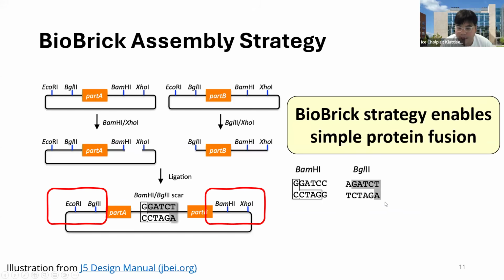So, this assembly will regenerate these cut sites as well. And that was one of the methods that synthetic biologists have been using in the past 10 years. These days, we probably don't really need these complicated designs anymore, because synthesis and PCR are a lot easier.